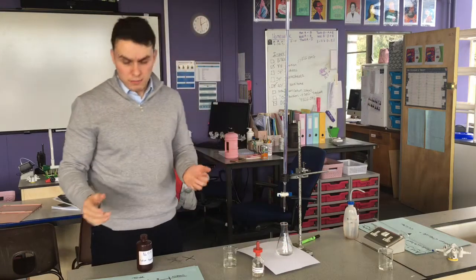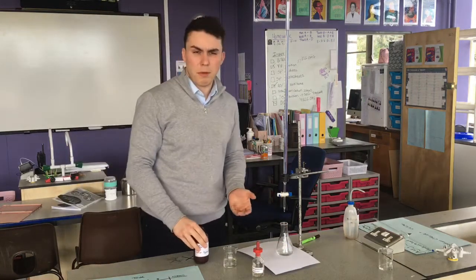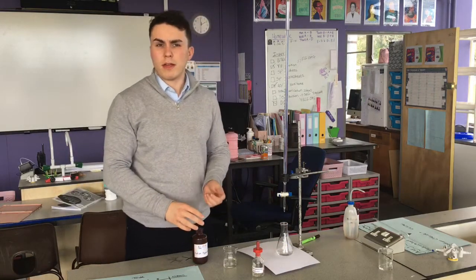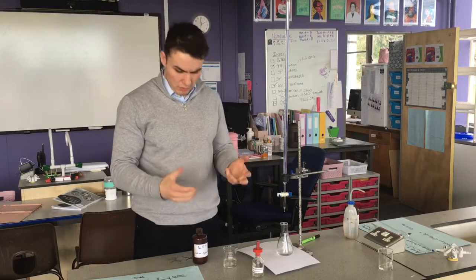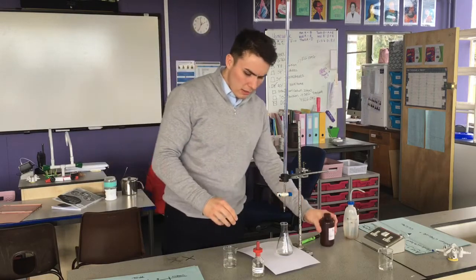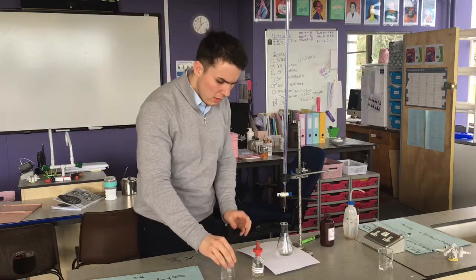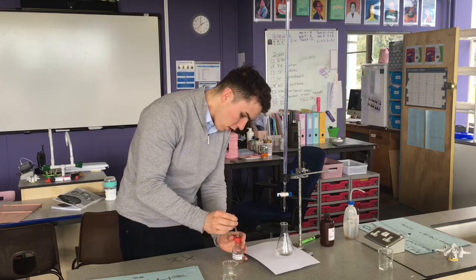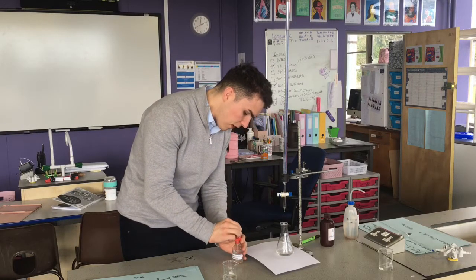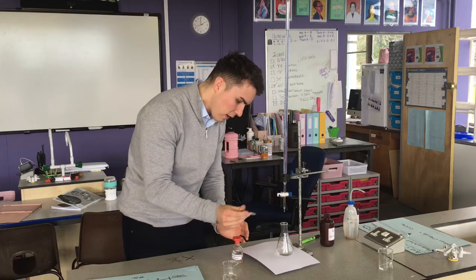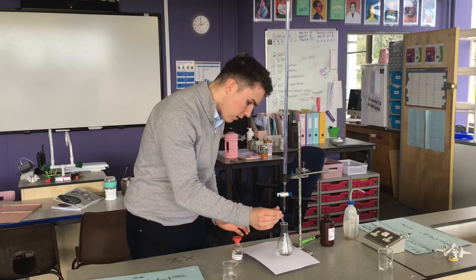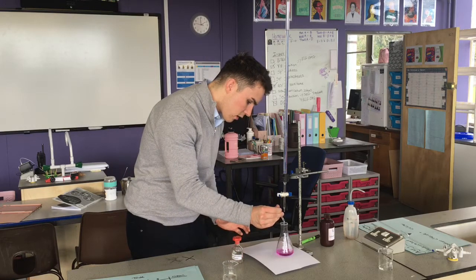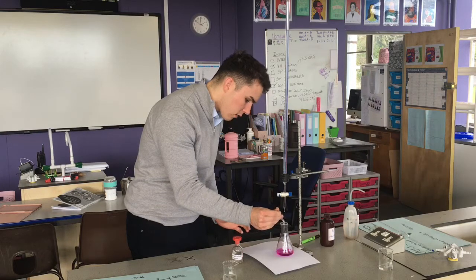We could use a white towel here. The reason I'm using a white piece of paper is for colour change — I really want to be able to see that colour change. I'm then going to add a couple of drops of my phenolphthalein indicator, and straight away you can see that pink colour.